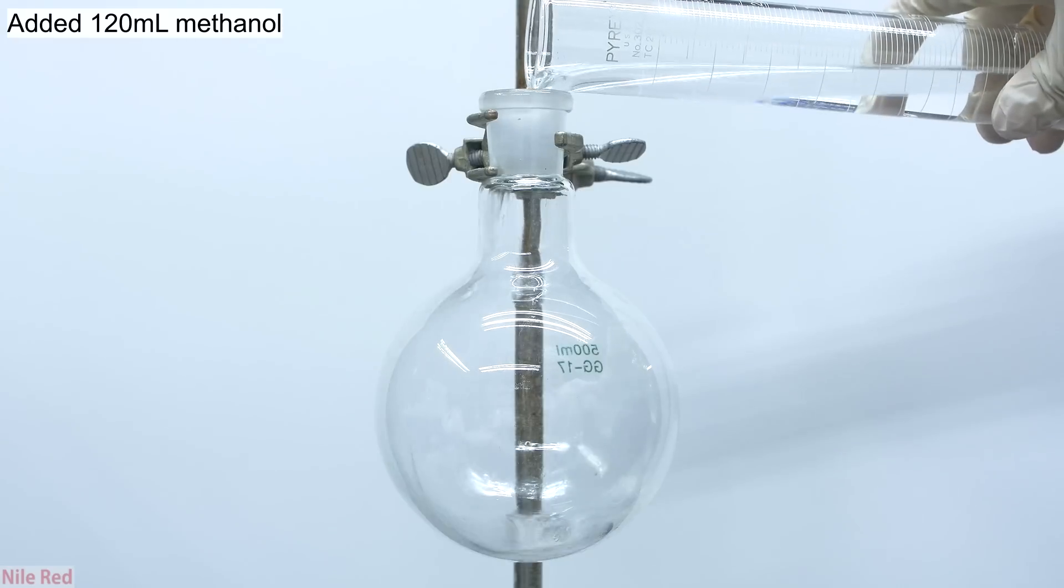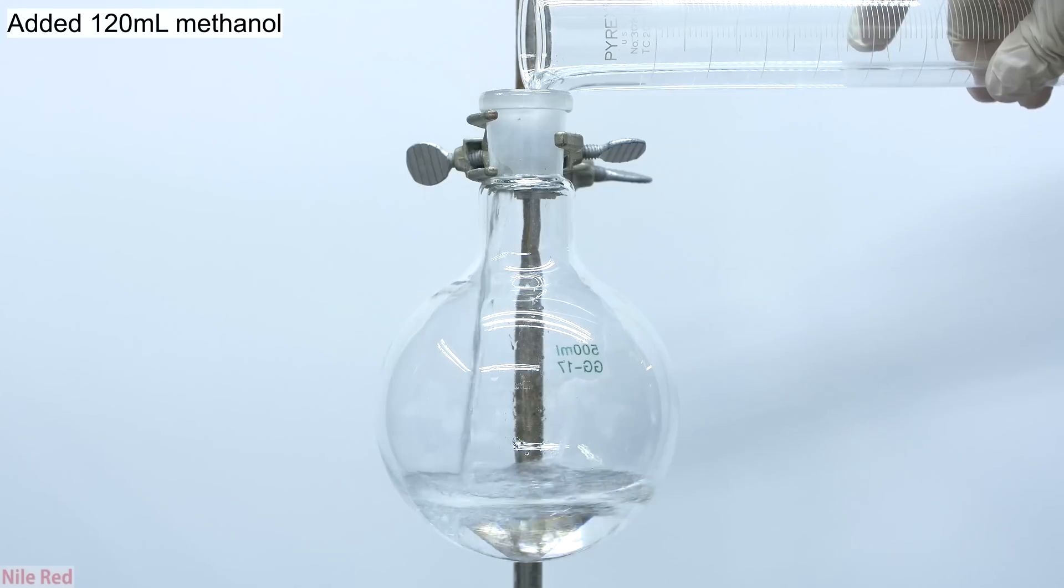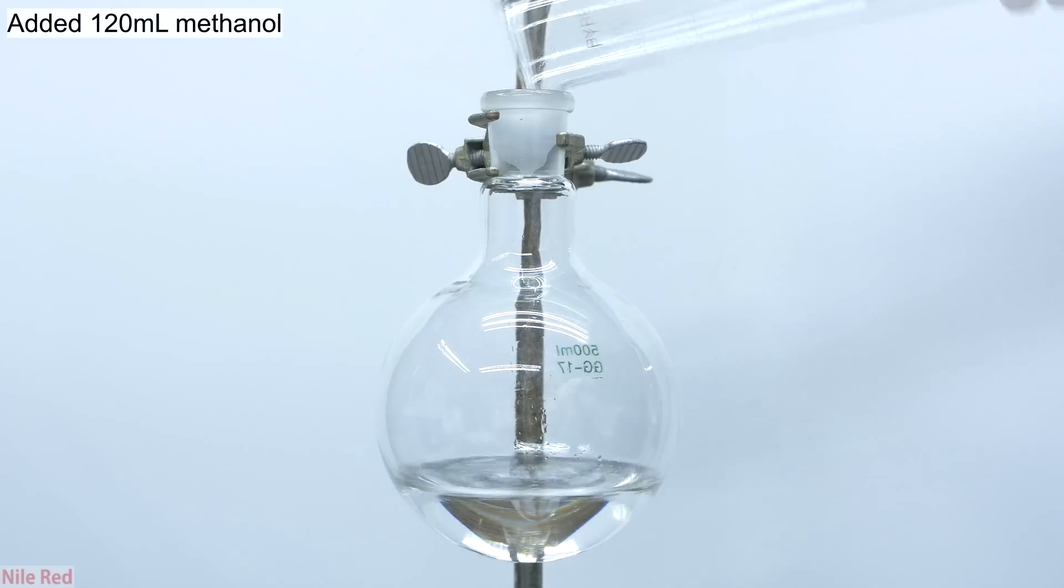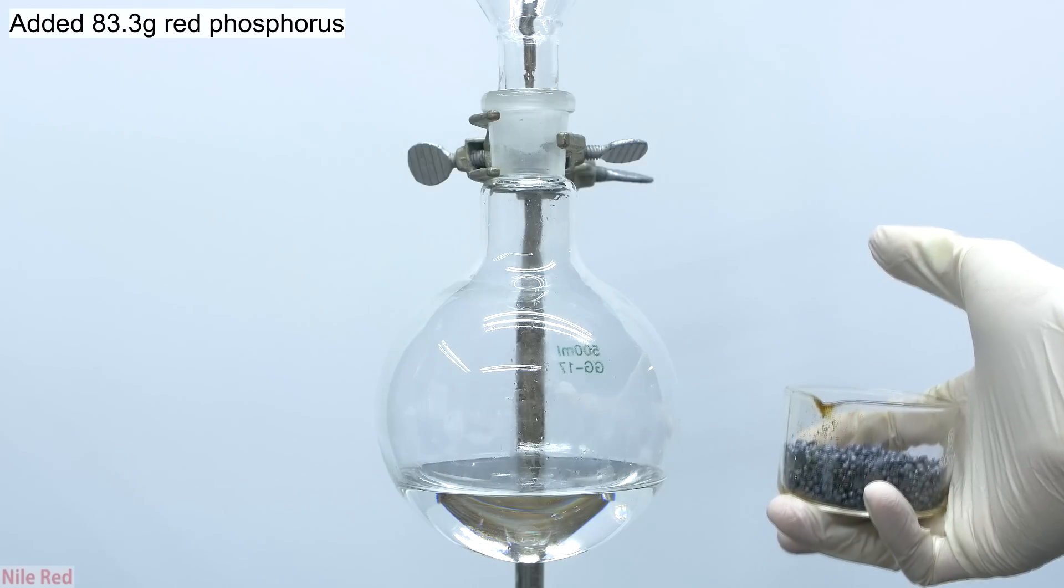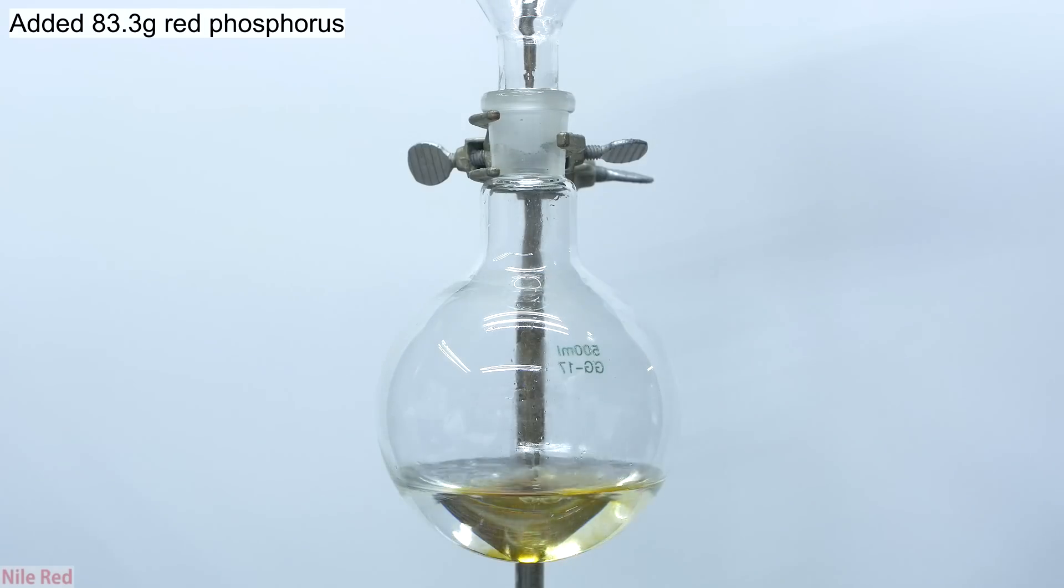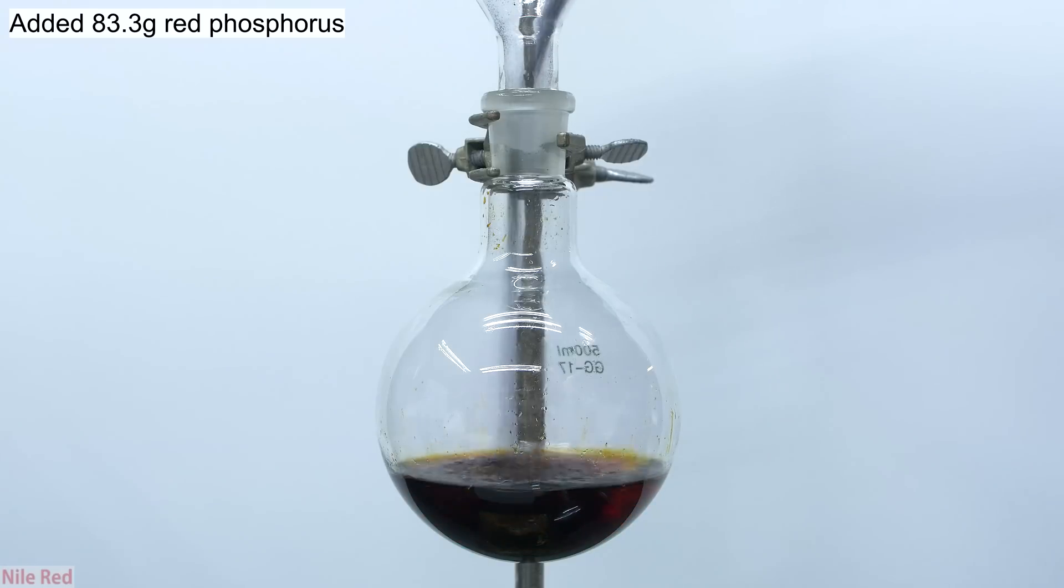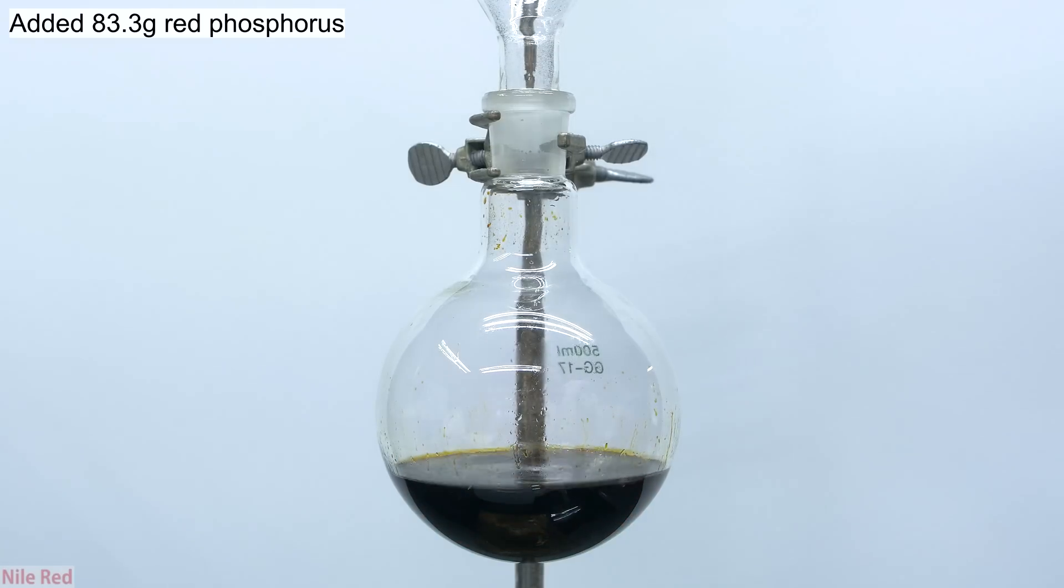To start things off, I poured in about 120 milliliters of methanol into a round bottom flask. Into the methanol I then dumped in directly about 83.3 grams of iodine. The moment that it's added, it starts to dissolve in the methanol and very quickly becomes a nearly black color.